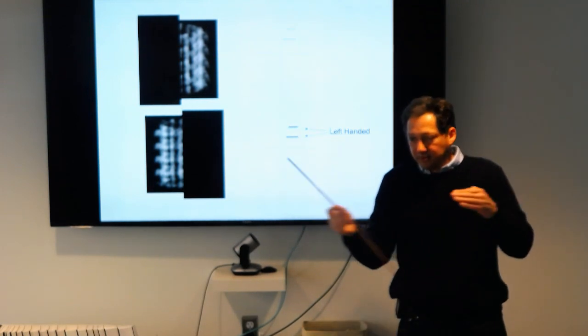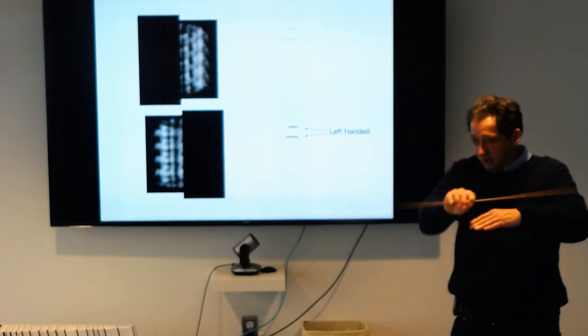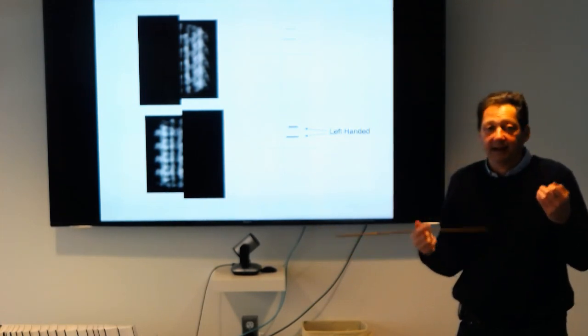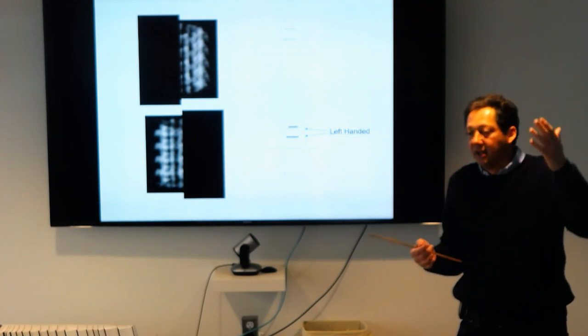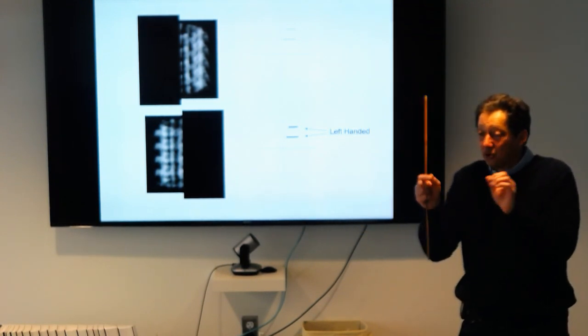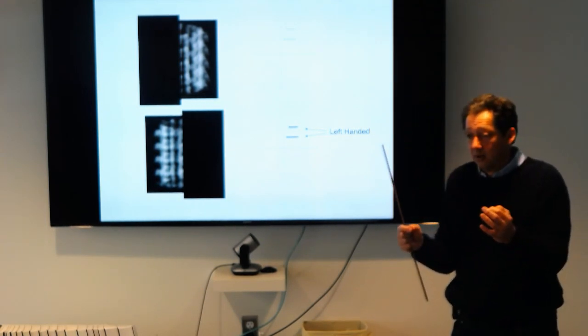These are the same order, so they have the same information. But if you have vectors going in different directions, like one is layer line 1, and another layer line, I don't know, 23, which is -2, you have two layer lines there. You can now use these two different layer lines to actually find the selection rule, okay?